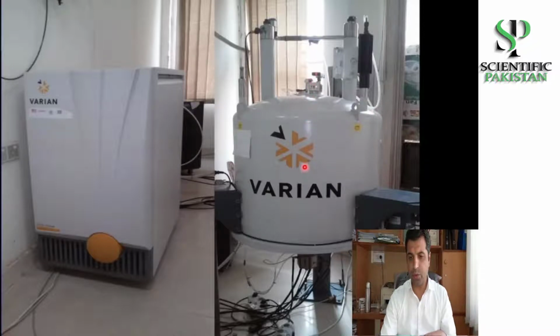Here is the probe right in the center, surrounded by the radio frequency coils and the magnet coils, and this magnet is actually immersed in liquid helium. And for that, you see these 4 filling inlets, 2 here in white and 1 here in black, and the other one is right behind this white one. So we have 2 cores.